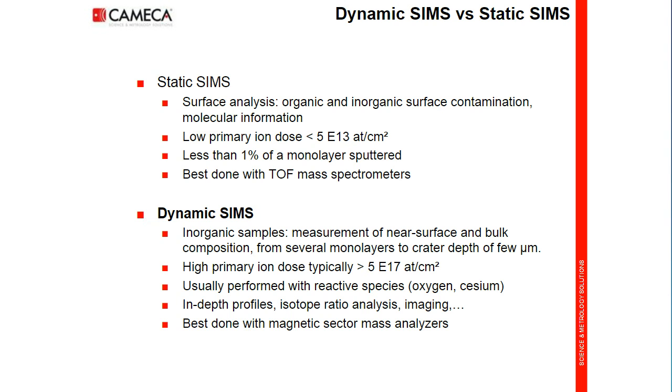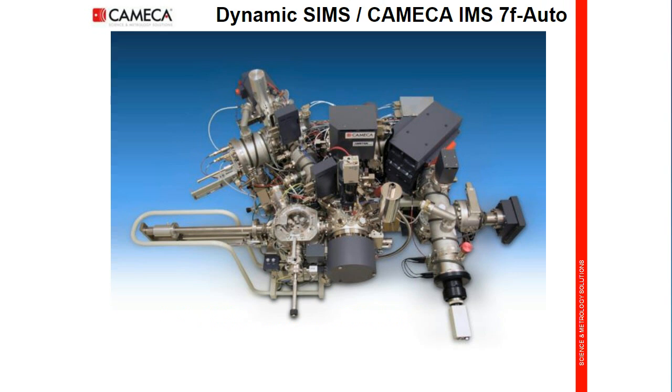Best performance for dynamic SIMS measurements is obtained using magnetic sector mass analyzers. All measurements shown in this talk have been performed using the CAMECA IMS7F or IMS7F Auto, which are magnetic sector mass analyzers dedicated to dynamic SIMS measurements.